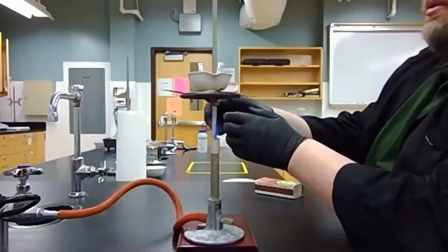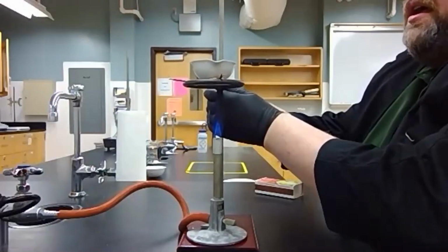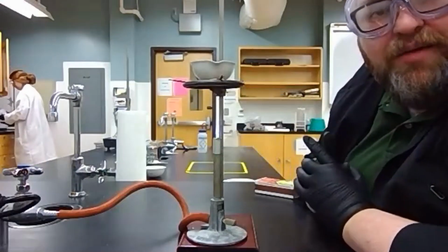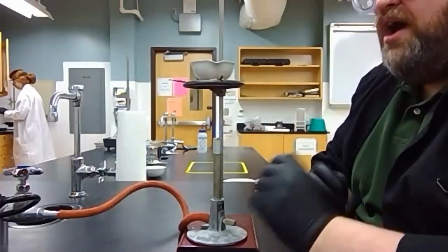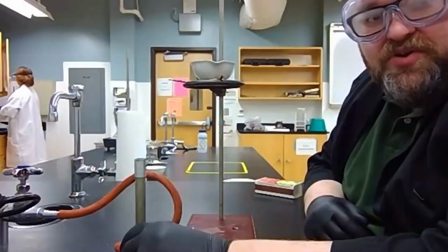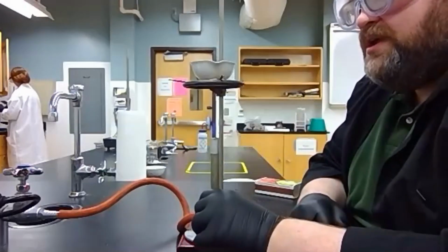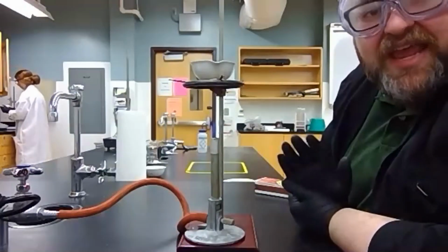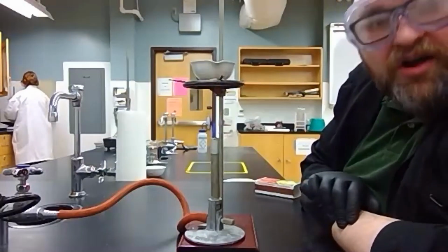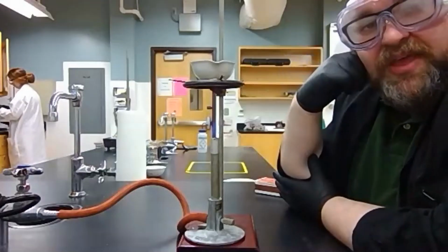Now, this is probably a little too close. It was too hot for my hand, so we're going to move that up some. And we want this to evaporate, not boil. So if it gets too hot and it starts bubbling and boiling, we're going to remove the heat and we're going to allow it to cool down. Then we can put the heat back on, or we can raise the level, or whatever we need to do. This will take time. It can take 30 to 45 minutes, depending on how much water you have in your solution. Once we're done with this, we're going to remove this from the heat.